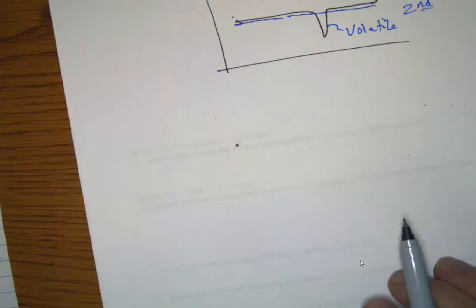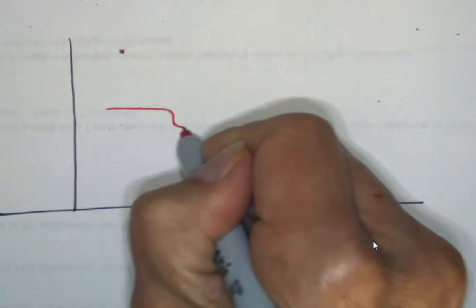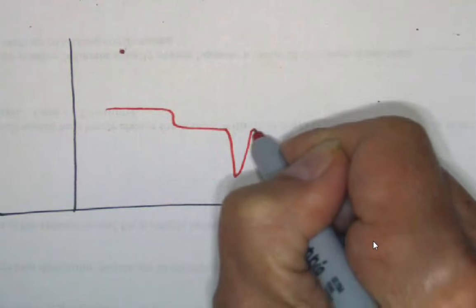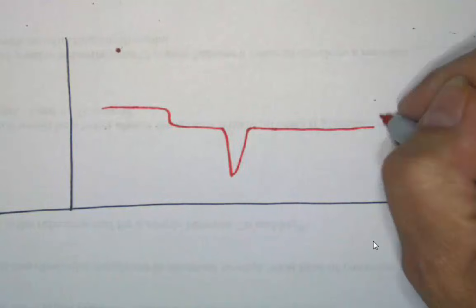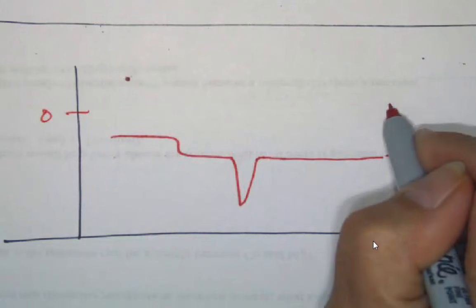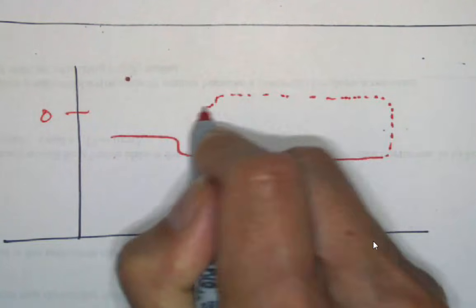All right, now all of this stuff interacts, and so let's look at an example of an interacting plot here. So your volatiles may affect the polymer's behavior. So let's say we do our first run and we get a Tg, and then we get an endotherm. We could continue this as a loop, so let's do that. And this is one option when you run your experiment, to just loop and do a controlled cool.